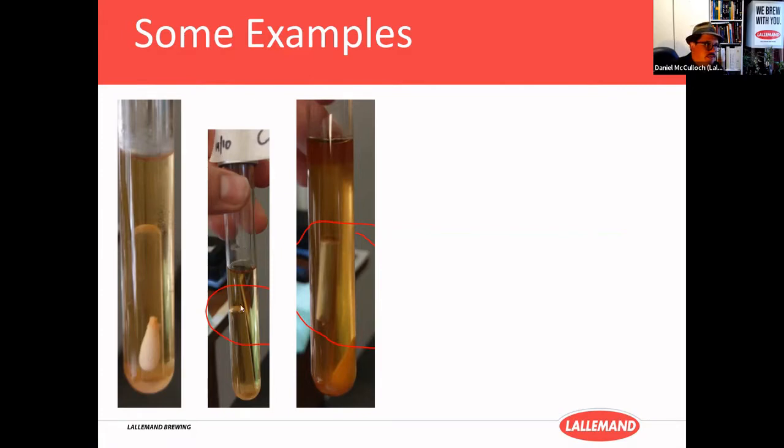Again, here are some other examples. There's a small bubble there. So sometimes that could happen if we have some glycogen reserves or trehalose reserves of the yeast itself that you're putting in there. Or if you've grabbed a beer midway through fermentation, you might see some small bubbling in the tube because it's using that sugar. But if there's not contamination, it hasn't completely filled the tube, like this one here.